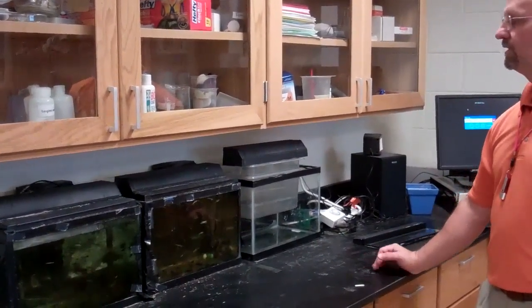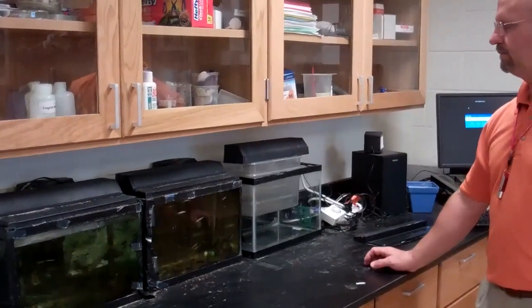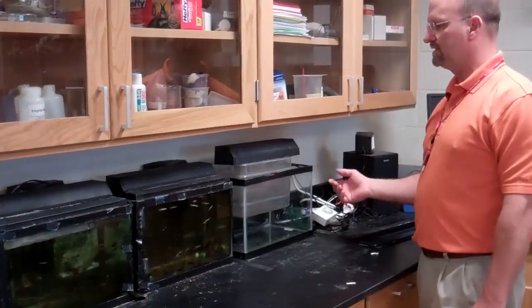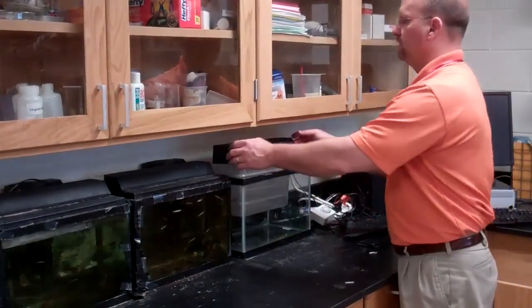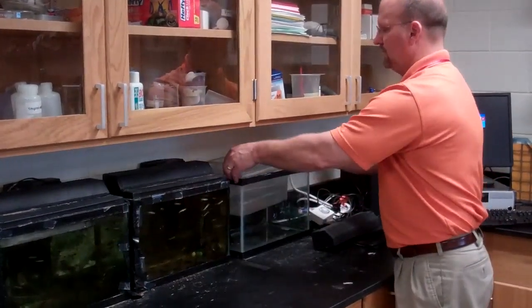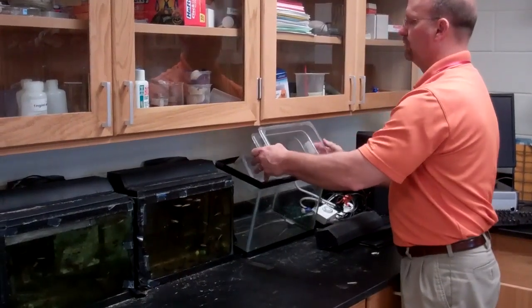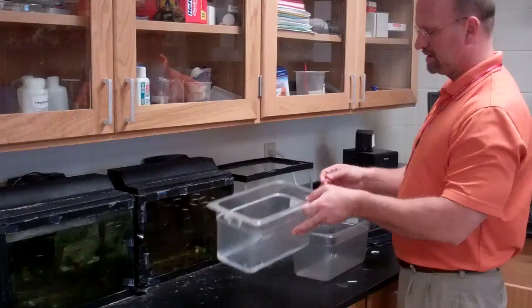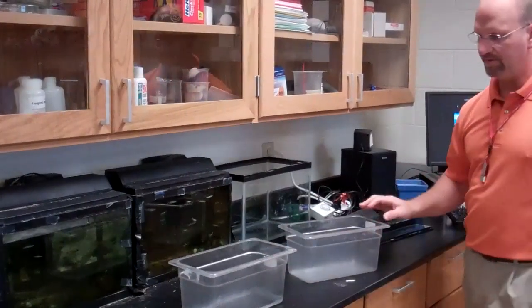So in the morning when the light comes on, the fish would mate, fertilize the eggs, and lay the eggs. Then I could simply take the light off, take the breeding chamber out, separate the fish back into their tanks, and I would have the eggs in here.